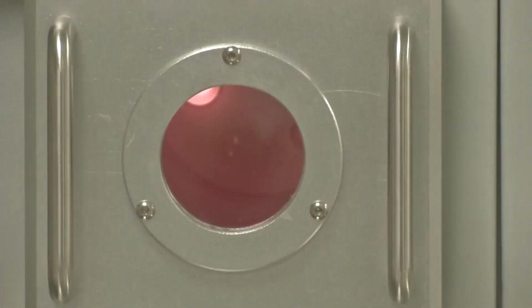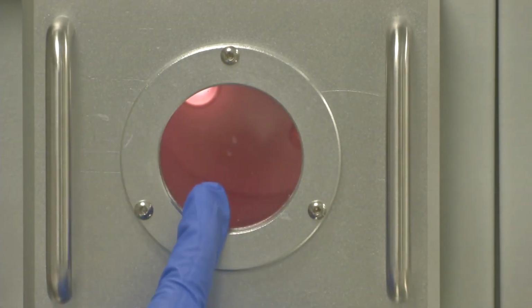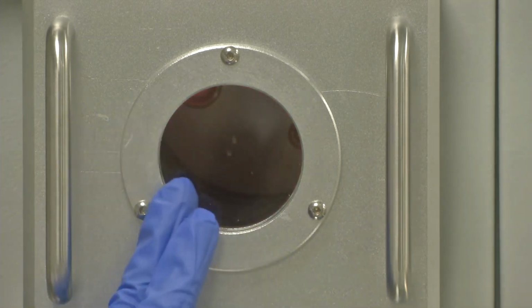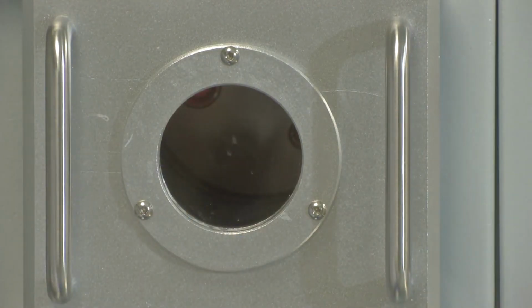Now let's see if the plasma goes away when I reduce the RF power. So I am reducing the RF power. Just look at the chamber. Keep looking at the chamber. You can see the intensity going down. And when I go to 0 power, the plasma will get extinguished. Now the plasma is gone and we have come back to a no plasma state.